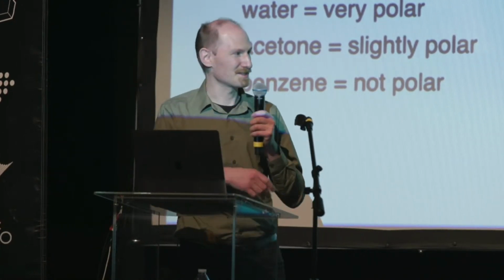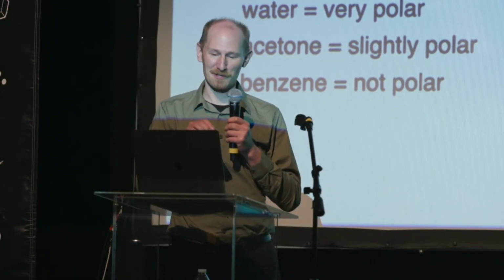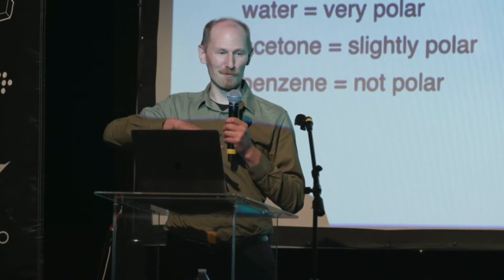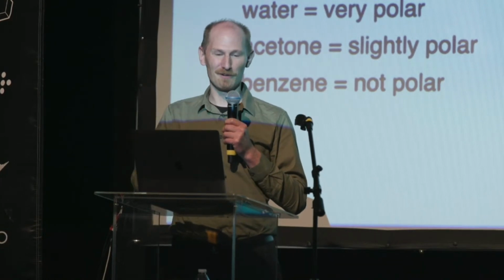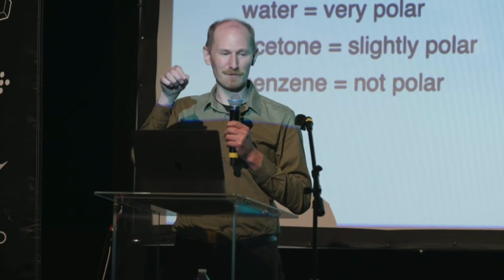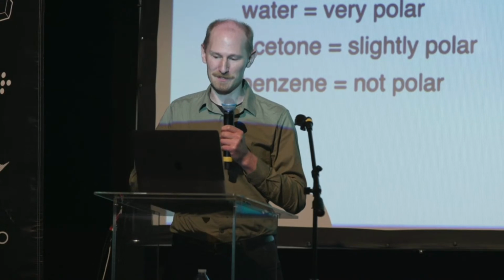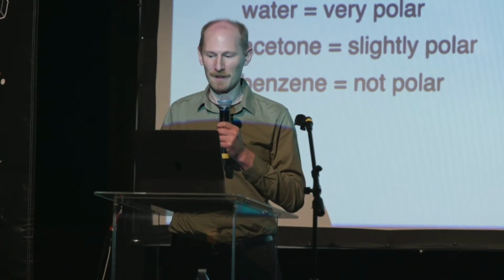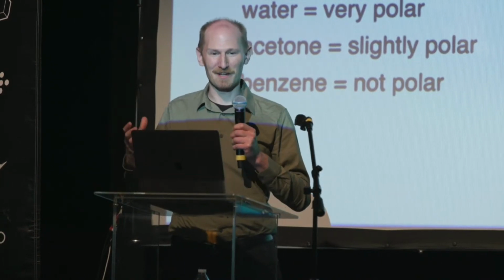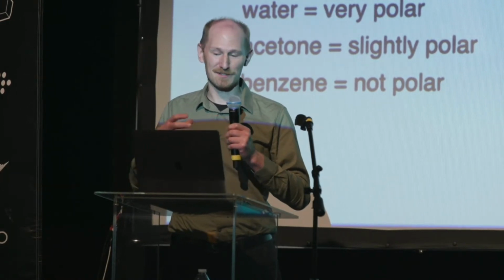Maybe you've seen this great science experiment as a kid, where you use a marker to draw on a piece of paper and then dip the paper down into alcohol. As the alcohol wicks up through the paper, it separates out all the compounds. Or if the dye is made of several different colors, it will separate those colors out. This is actually where the word chromatography comes from. It's basically separating out into colors. For some reason the name stuck, and we call everything chromatography now as long as you're separating compounds based on their ability to stick in a solid phase.